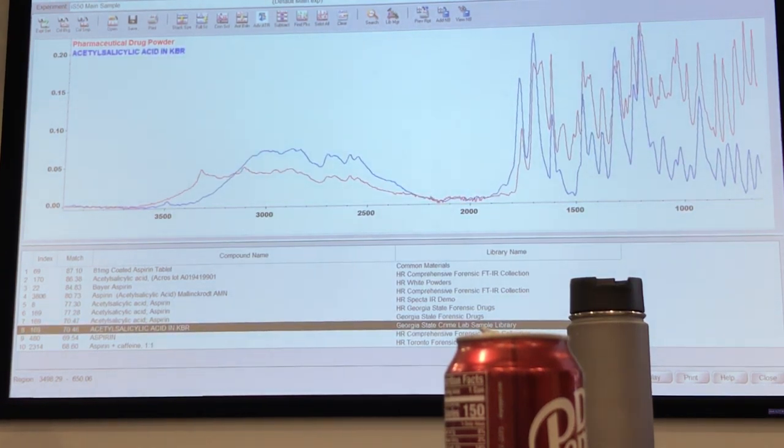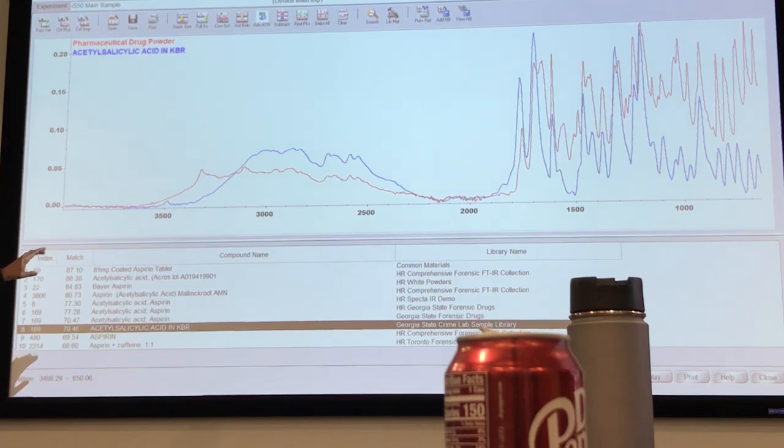So what we are seeing is a lot of peaks that would match and a lot of them that won't match, right? So this is the kind of hint you want to look at when you look at a sample. Yes, the top score material is what's going to be the best, but here that's because I have it in the library. If you don't have it in the library, it's just going to pull up all these things, and then what you really want to know is what is in there, right?